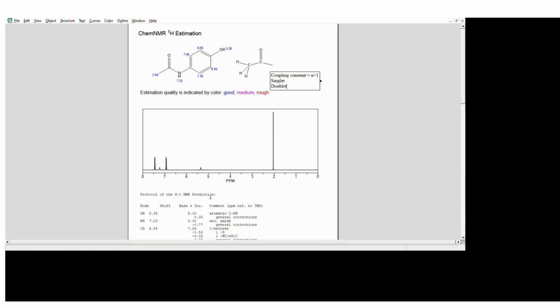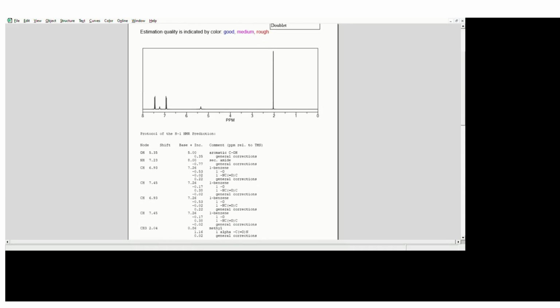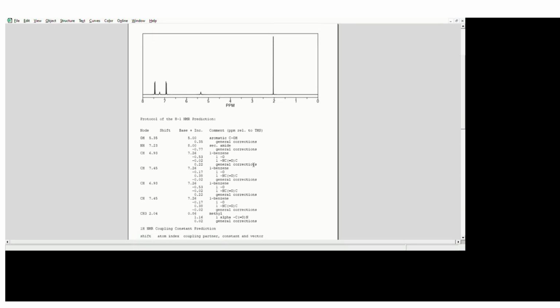Because when I discuss, everyone knows that, but when you're supposed to write in your notebook, you forget. So make a heading from the video and write down the same in your practical file and paste the spectra on the left side. Fine. As you just start with the NMR, we are supposed to write down the increment, the decrement.